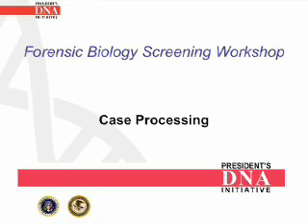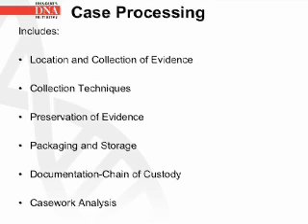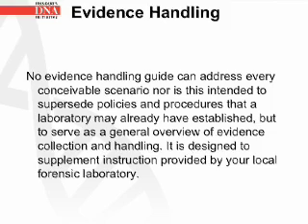Forensic Biology Screening Workshop, Case Processing. Case processing includes the following: location and collection of evidence, collection techniques, preservation of evidence, packaging and storage, documentation of chain of custody, and casework analysis.